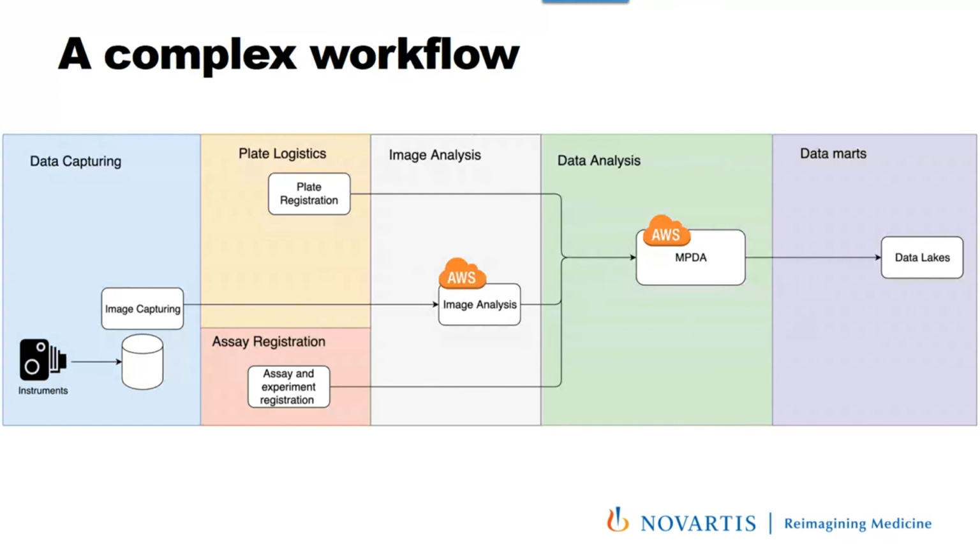Over on the left, we have the microscopes, the actual instruments that are doing the data capture itself. Once we have the images, the plates are registered, so there's associated experimental metadata attached to these images, and also other microscope data as well. And all of this goes into an image analysis platform, which is also AWS-driven, to go from images coming in to the readouts and measurements coming out on the other end. These readouts are then fed into MPDA, and once the analysis is done, the biologist has moved things along to where results can be gathered. This can then be deposited into a data store or data lake.